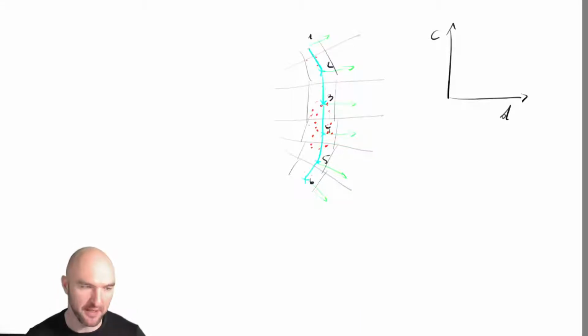So let's go and pick one individual interface, and we already have our decomposition. We already have our patch to OBJs. So we have the individual OBJs, and I'll show you how to do that in Blender, which is really easy. You already know that, yeah. So you could just go and pick one of them and then export it as an individual OBJ. Yeah. So this is pretty simple, but we can also do that inside of MATLAB.